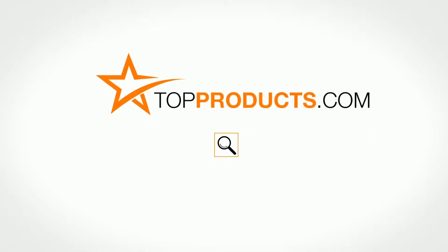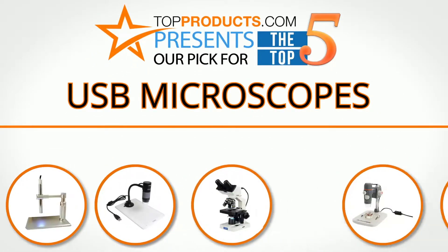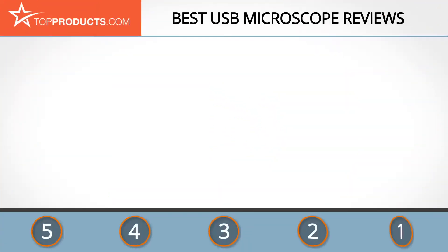TopProducts.com presents our pick for the top five USB microscopes. For this review we chose five brands known for quality USB microscopes, showcasing a variety of options that are available.